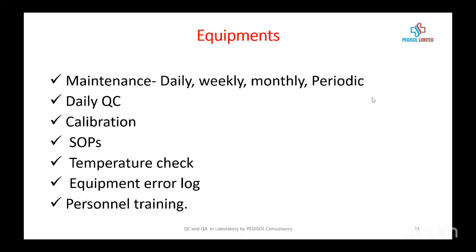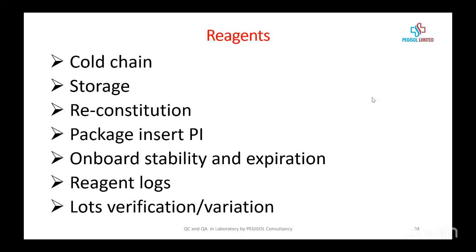If the maintenance is not done, as I said earlier, it can affect the QC. Then daily quality control. The daily quality control on the equipment should be done. Calibration should be done as I went through. There should be an SOP, a temperature check, equipment error log, personnel training, and so on.